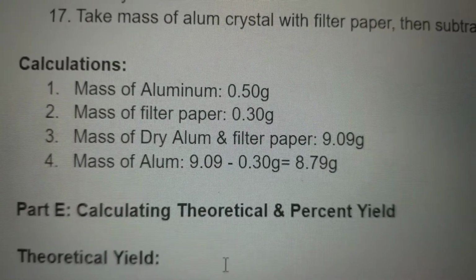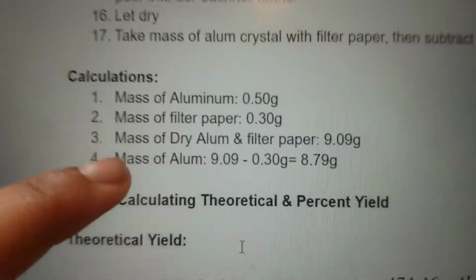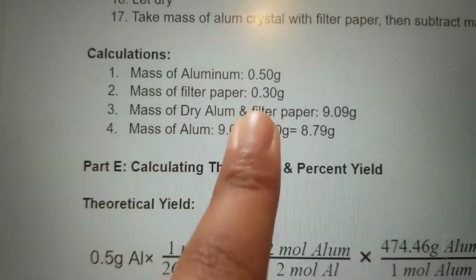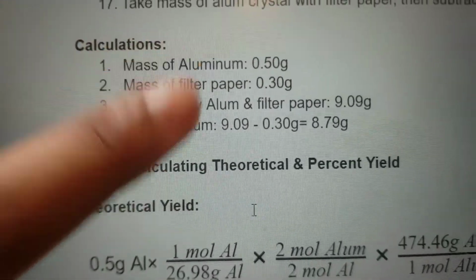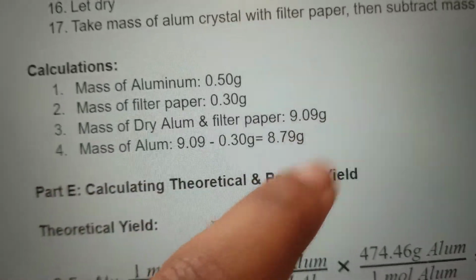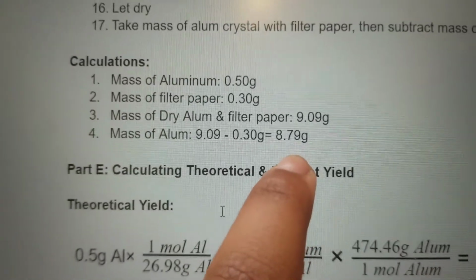The mass of our aluminum, to begin with, was 0.5 grams. And then the mass of our filter paper, what we used for the Buchner vacuum filtration, was 0.30 grams. And then the mass of the dry alum and filter paper at the end of everything was 9.09 grams. So the mass of our alum at the end of our experiment was 8.79 grams.